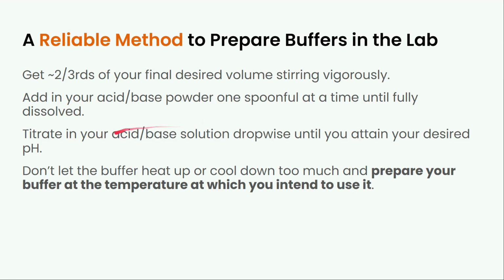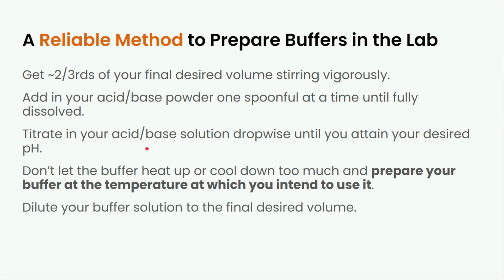Don't let the buffer heat up or cool down too much, and prepare it at the temperature which you intend to use it at, for all the reasons we've said earlier. And then dilute your buffer to the final volume. Some people have asked me, does the powder that you dissolve, your 60 grams of Tris, is that included in the final volume? And the answer is yes. The powder is always included in the final volume of your buffer.